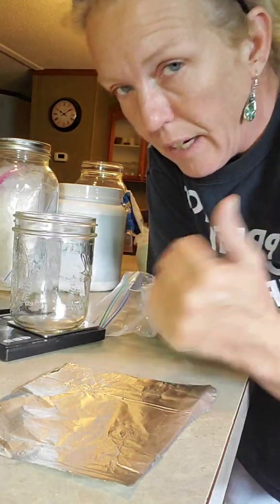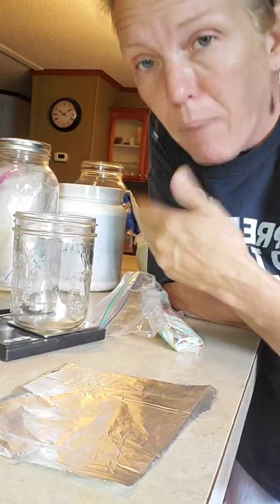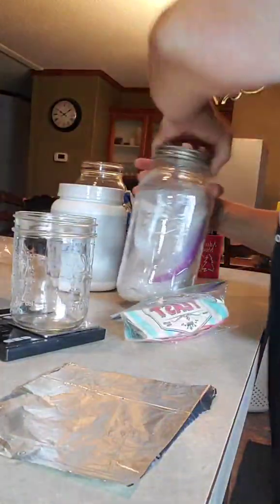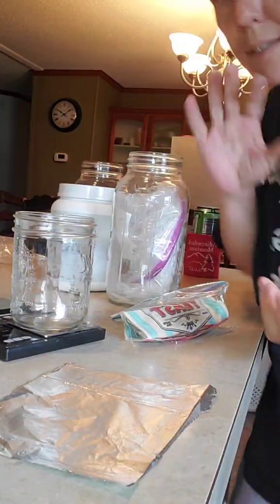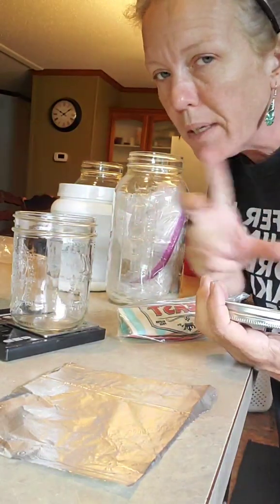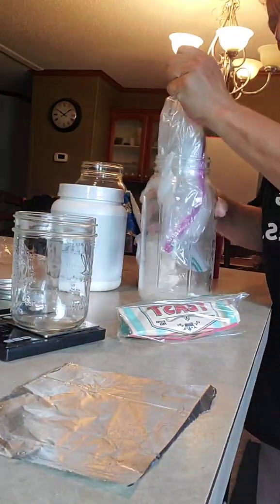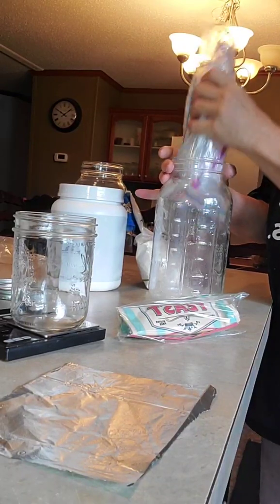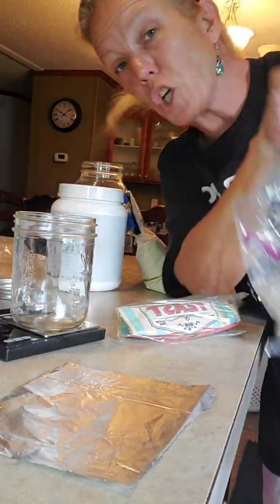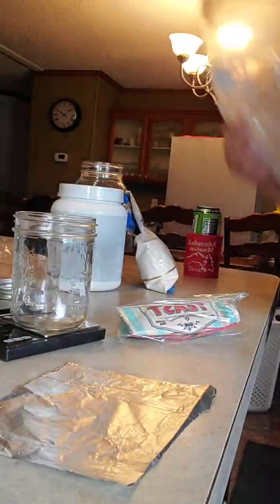When you're doing malt extract agar, you're using water, agar powder, and malt extract that they use in brewing beers and wines and stuff like that. It's important to keep these things sealed because they will grab humidity in the air and you have a bunch of a chunky mess and you don't want that. And notice, even though it's in a mason jar, it's still in a Ziploc bag. Actually, my bad, 2 Ziploc bags.